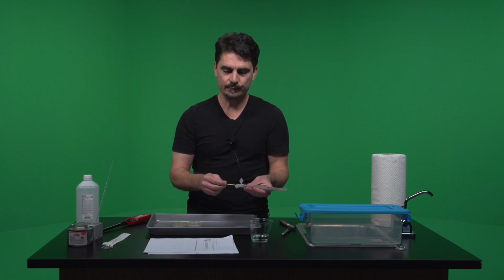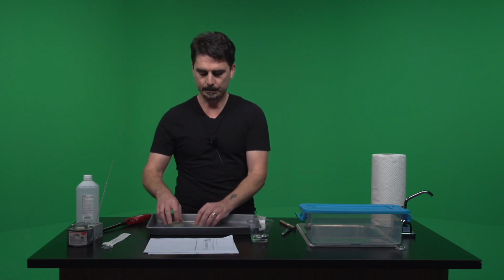And so when we do this first quadrant, what we're doing is we are actually inoculating the plate. That's the inoculation step. We are taking microbes from the nose, from the ear, from wherever it is, and we're putting it directly onto the Petri dish, which is full of nutrients, right? And so that's the inoculation step. When we actually streak with the inoculation loop, that is the quadrant streaking. Okay, but let's get back to our plates here.